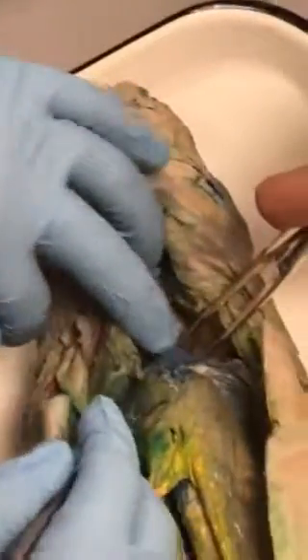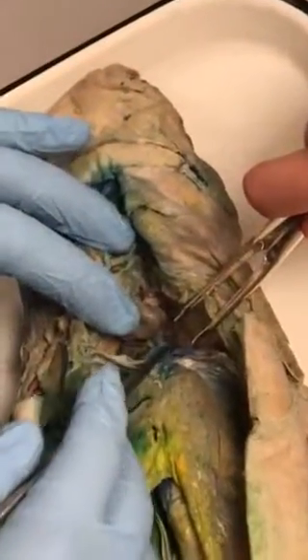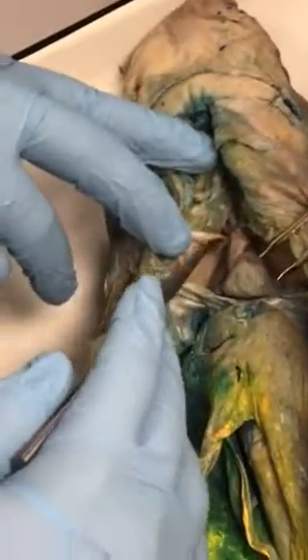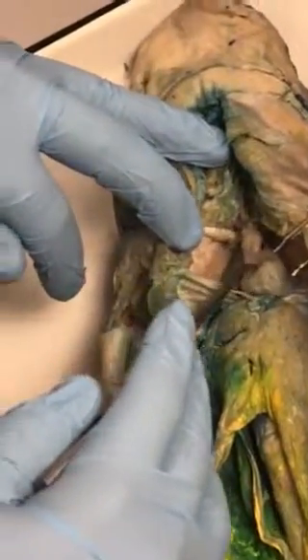So the sinus venosus, or however you say it, is this blue thing under the heart, lining in here. It's like in the frog. Okay. Conus arteriosus. Conus arteriosus. That's this big thing coming right off the ventricle here.